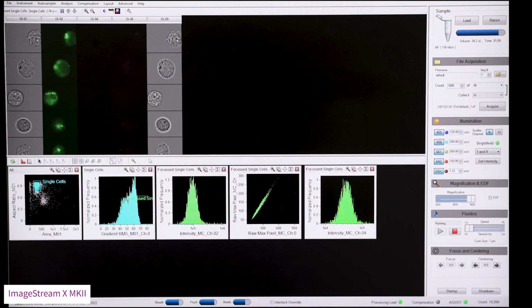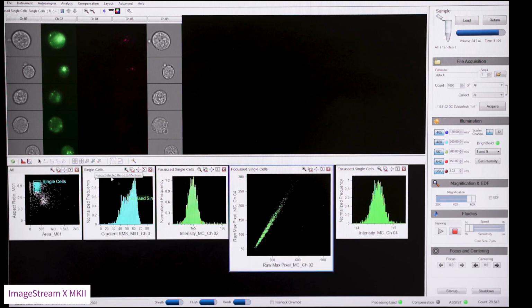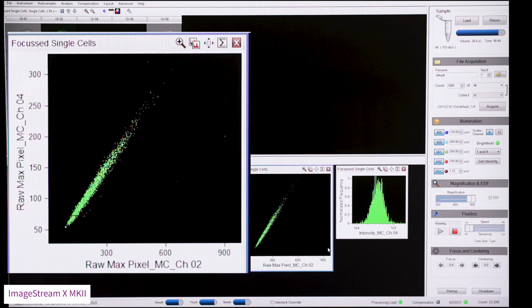Our next job is to look for saturation and adjust our laser power accordingly. Saturated pixels are seen in the images as red pixels. There don't appear to be any saturated pixels on this sample. However, we can use the raw max pixel scatter plot that we created at the start to quantify this. The raw max pixel plot shows the raw pixel values for our images. The maximum value of the camera is 4095. So if we see a significant proportion of pixels at this very highest level, then we know there is too much saturation and we will need to reduce the laser power.